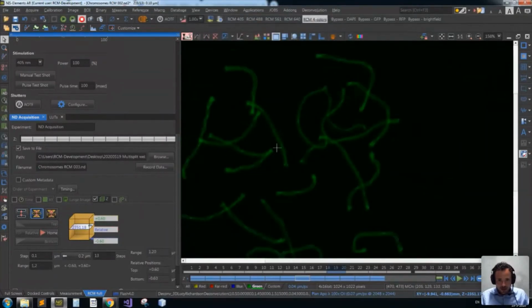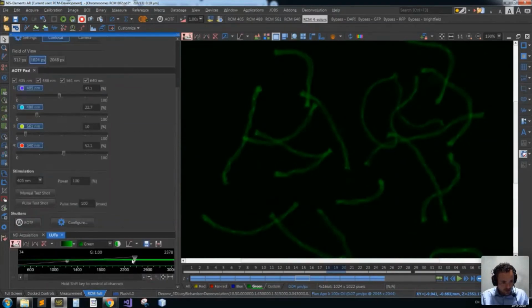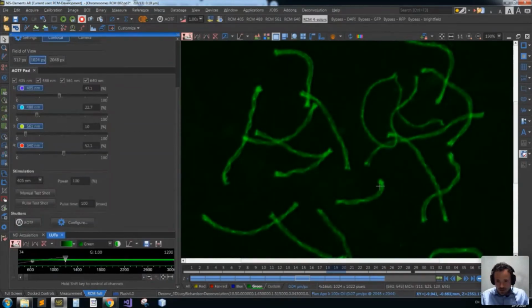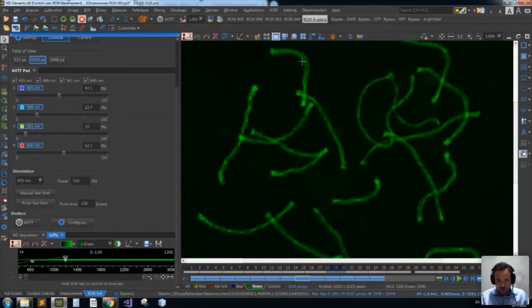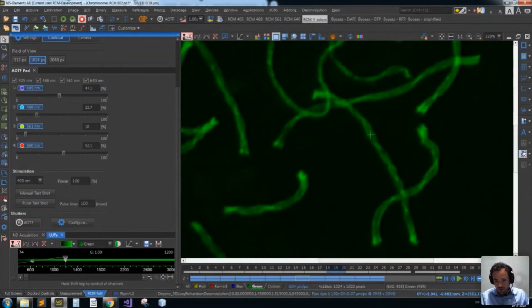And here we have the deconvolved result. So obviously, as you can see, now I suddenly start to resolve a lot more. Here I can see that the spread is very pronounced, and here as well, you can see with some imagination that this chromosome is also spiraling.